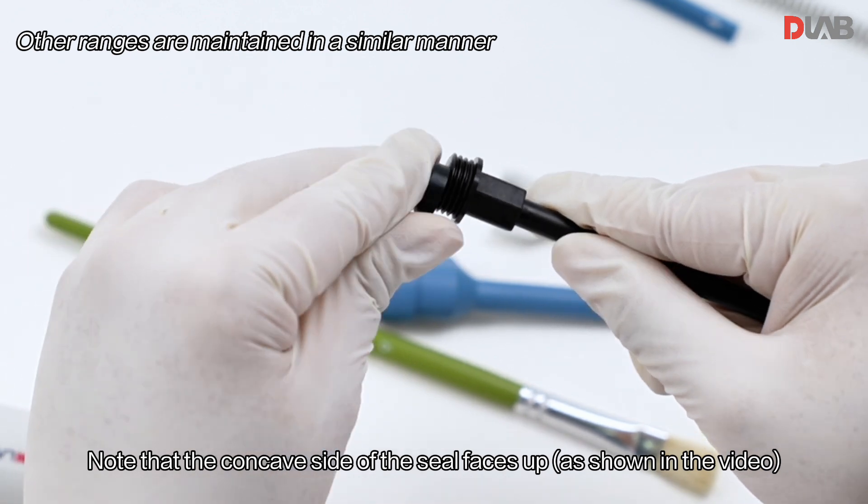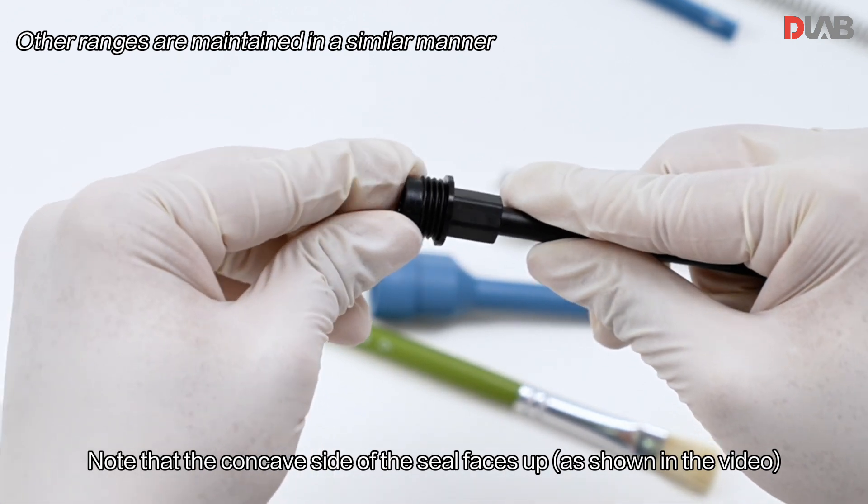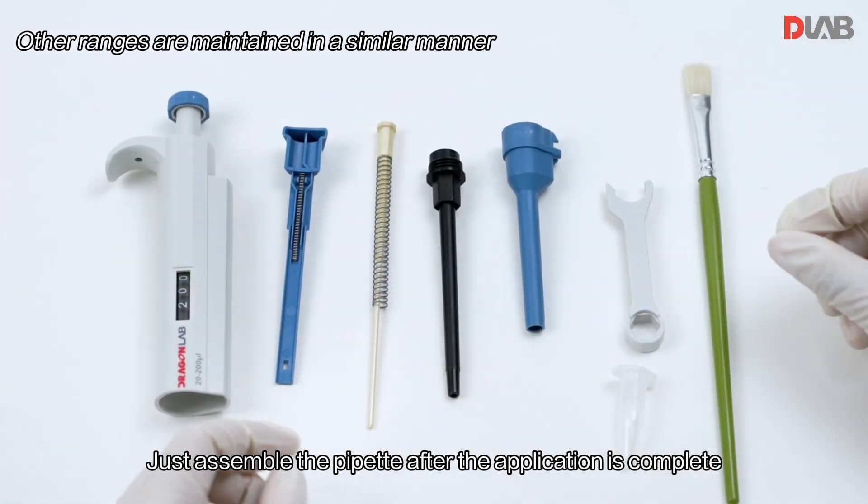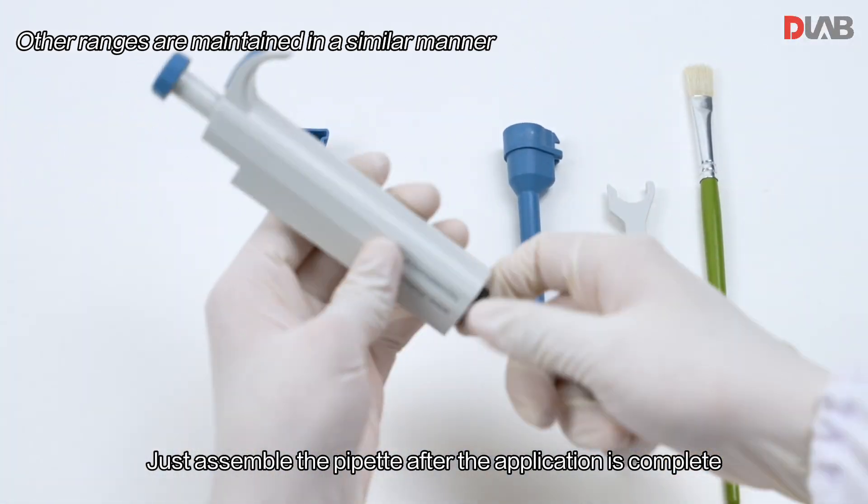Note that the concave side of the seal faces up, as shown in the video. Then reassemble the pipette once the application is complete.